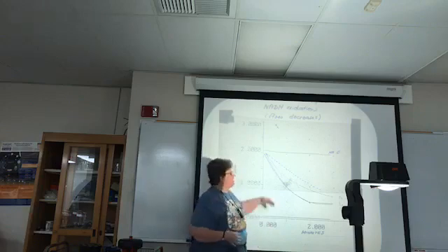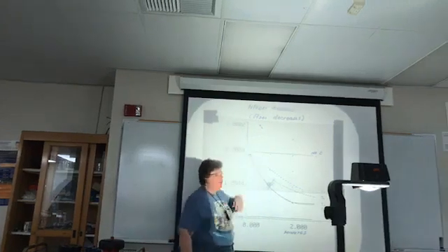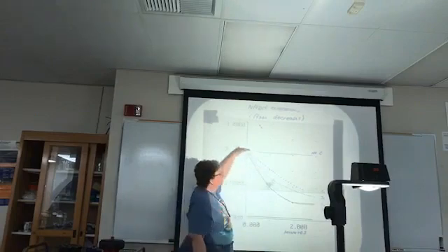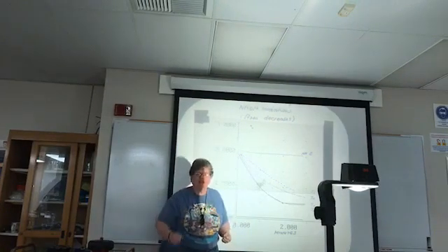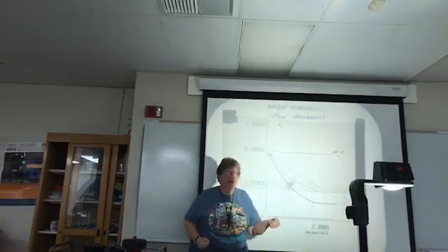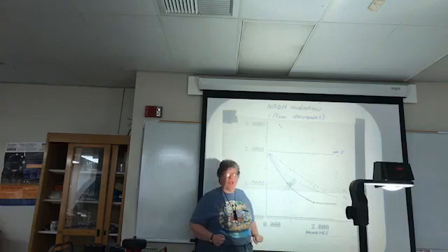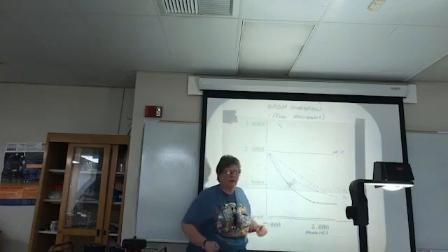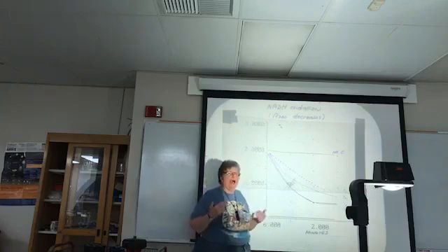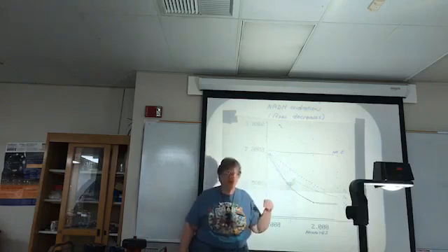So our NADH has a high absorbance initially, around 2, 1.8, 1.7, whatever it starts off being, a high number, and it does not matter what your initial number is. From one assay to the next, as you get a tiny bit more or a bit less when you're pipetting your NADH in the tube, your initial starting point may change. So the first reaction, you may have a starting number of 1.8, then it may go up to 2, then it may go down to 1.7. That's okay. What matters is the rate of the reaction, the change in absorbance with change of time.